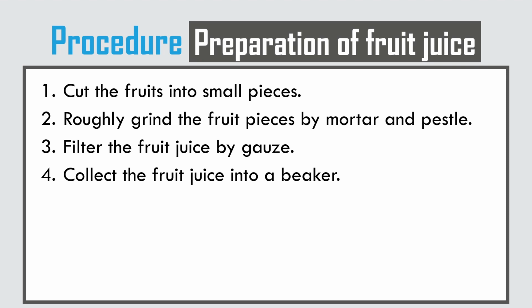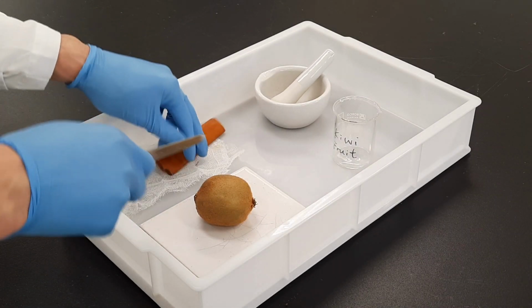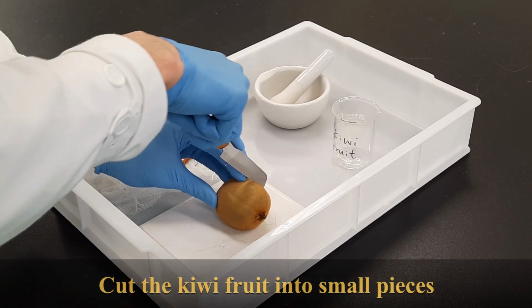And here is the procedure of preparation of the fruit juice. Let's watch the video again. Cut the kiwi fruit into small pieces.